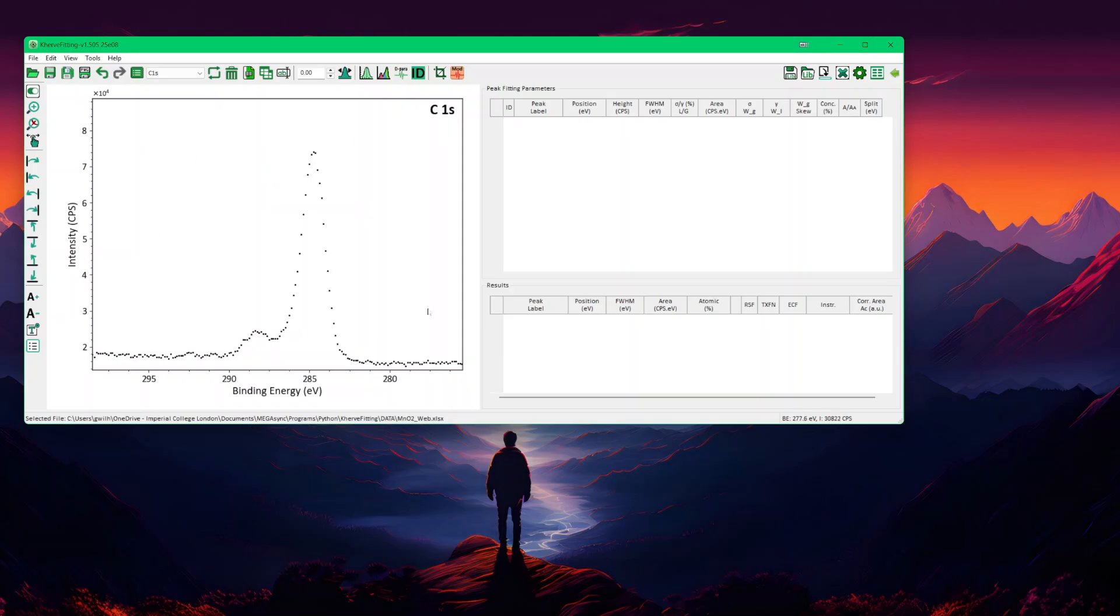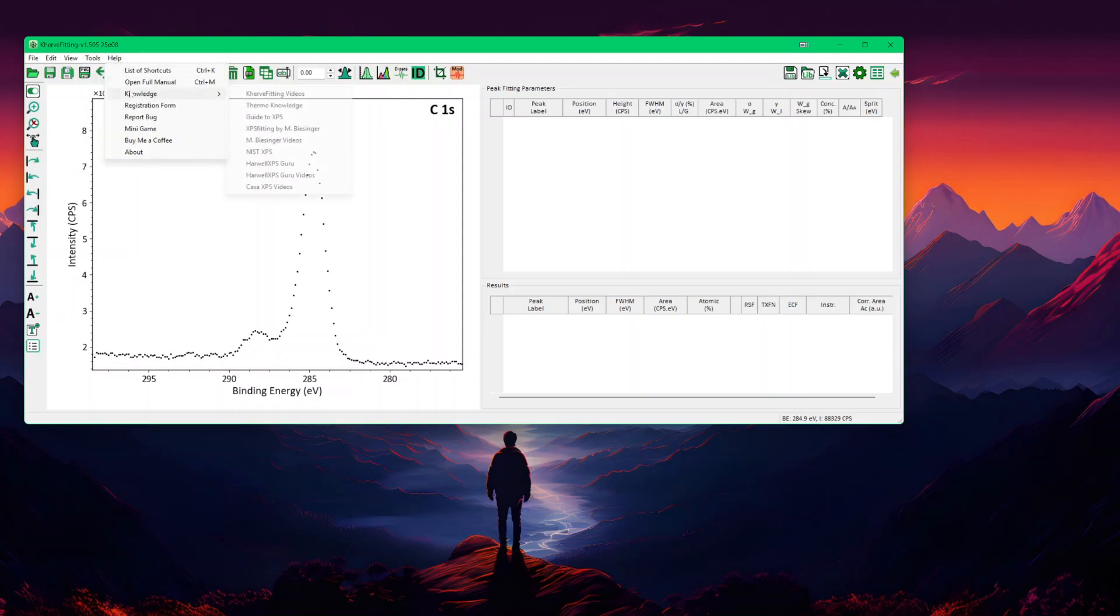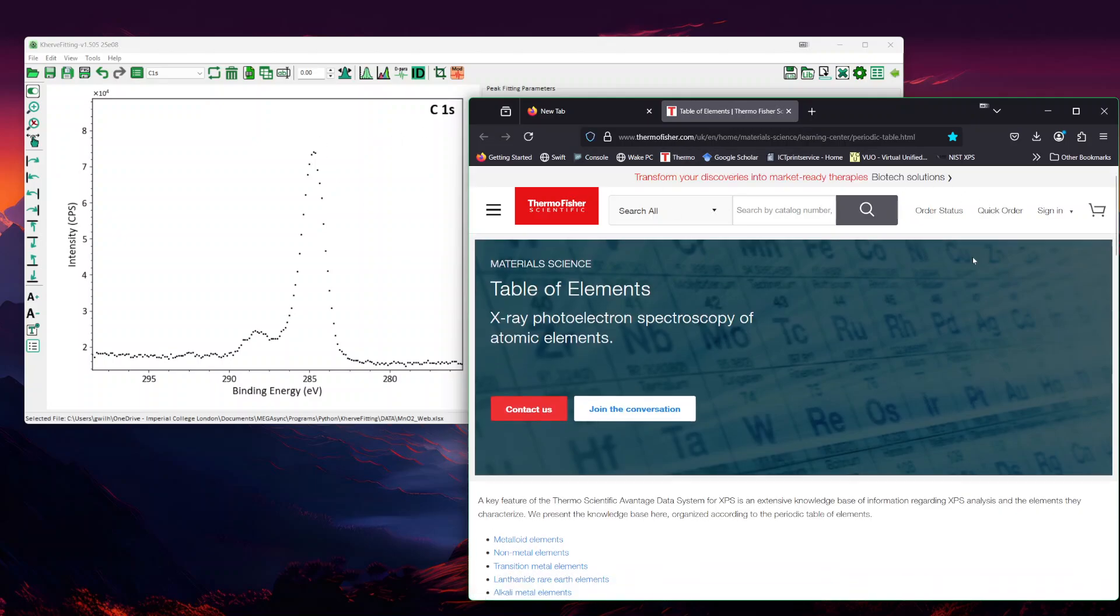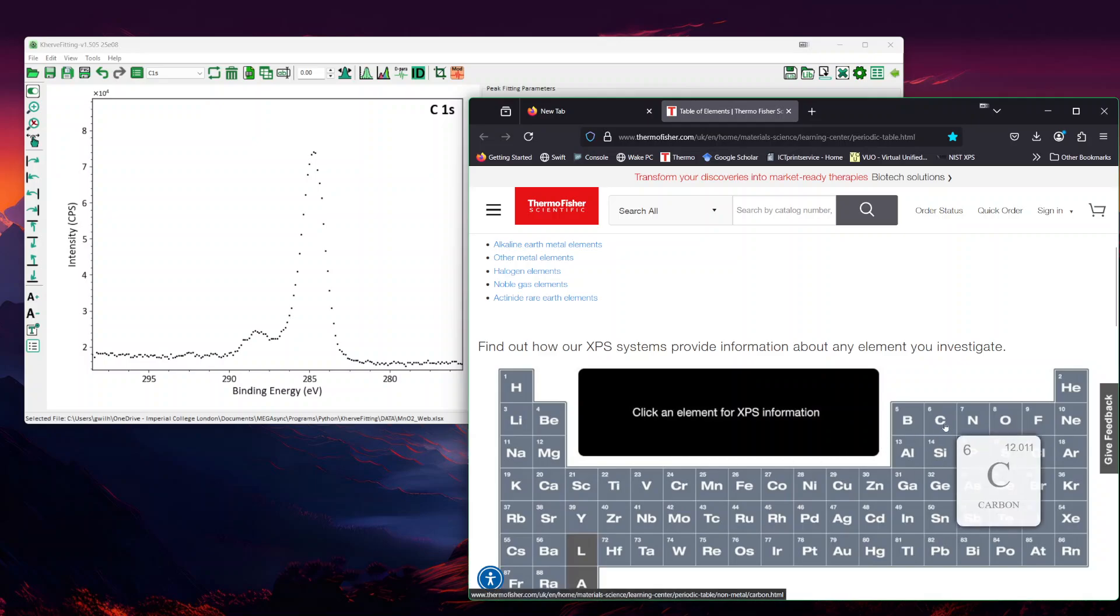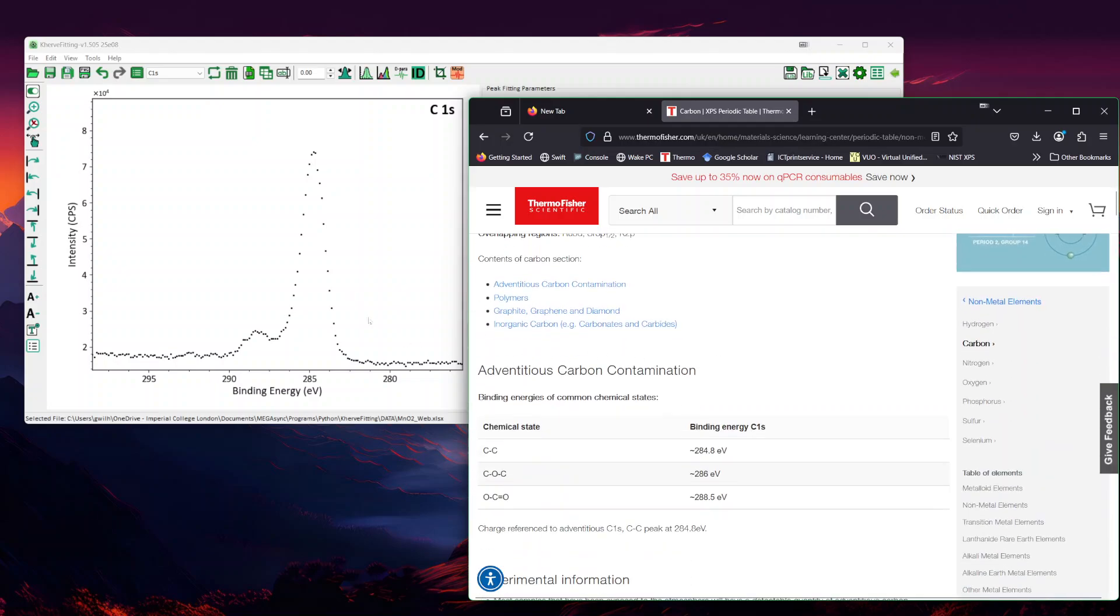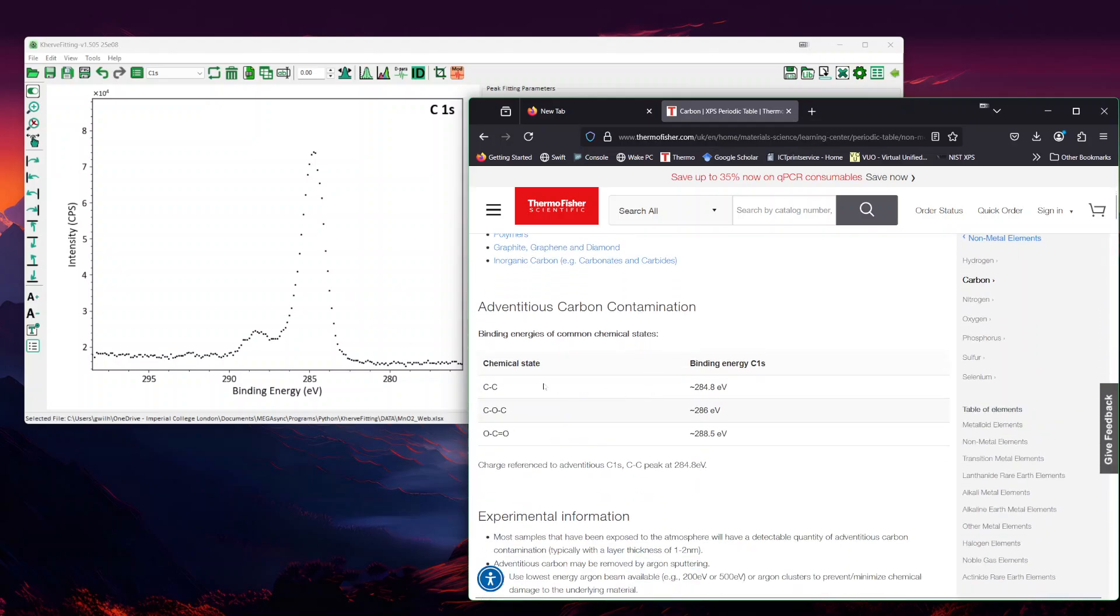Before you start fitting, it's always good to go into the knowledge to just know what you should be looking for. In the help, there is a knowledge base where you can find all the different websites I usually go through. One is called Thermo Knowledge, the one I would usually go for to check quickly what I'm expecting. I go down into the periodic table and then in this case, going to carbon.